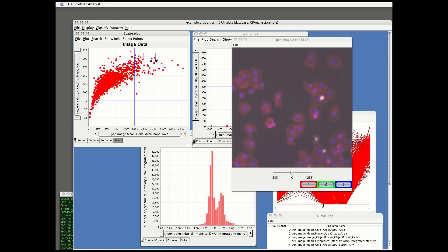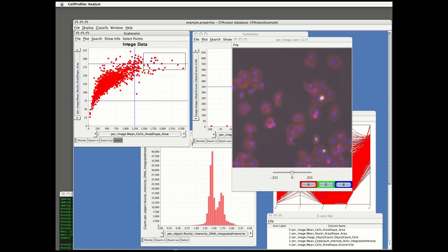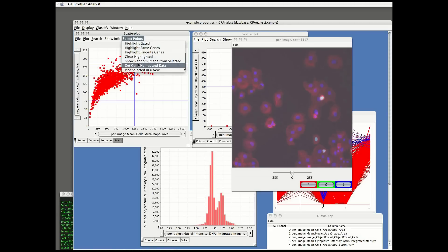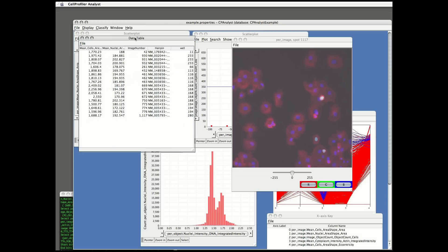To explore a subset of data points and get an idea of what samples are there, I can highlight them and choose select points, get gene names, and data. This produces a short list of just the samples in that highlighted subset of data points.